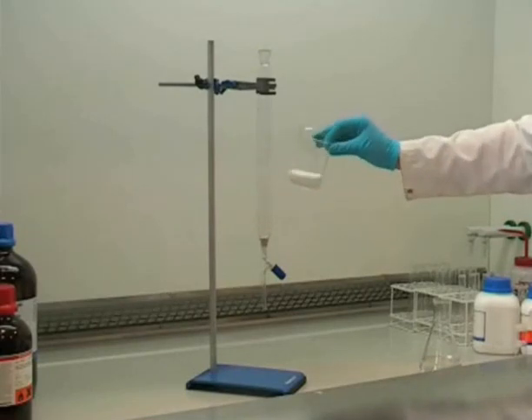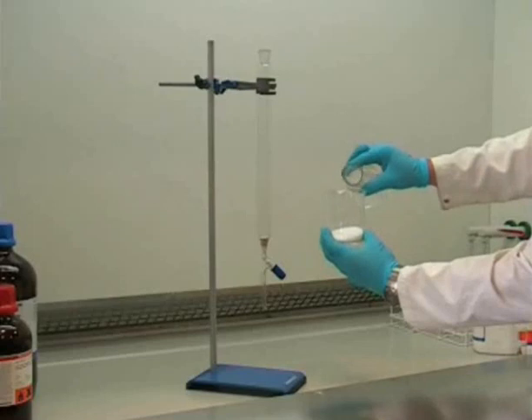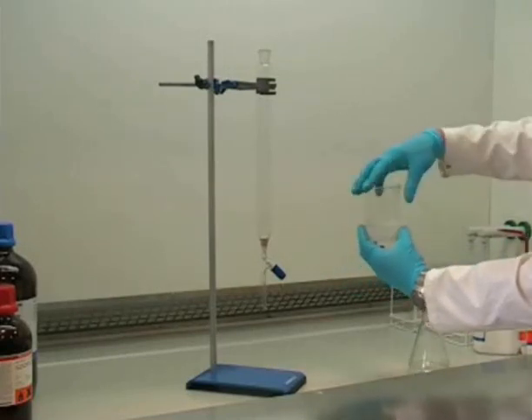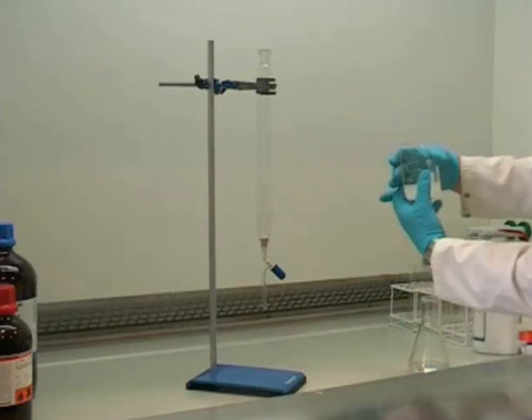We then take the appropriate amount of silica in a beaker, and this is then made into a slurry using the solvent we are going to run the column with. This solvent is known as the eluent. Here you can see us swirling the silica with the solvent before pouring it into the column very carefully.